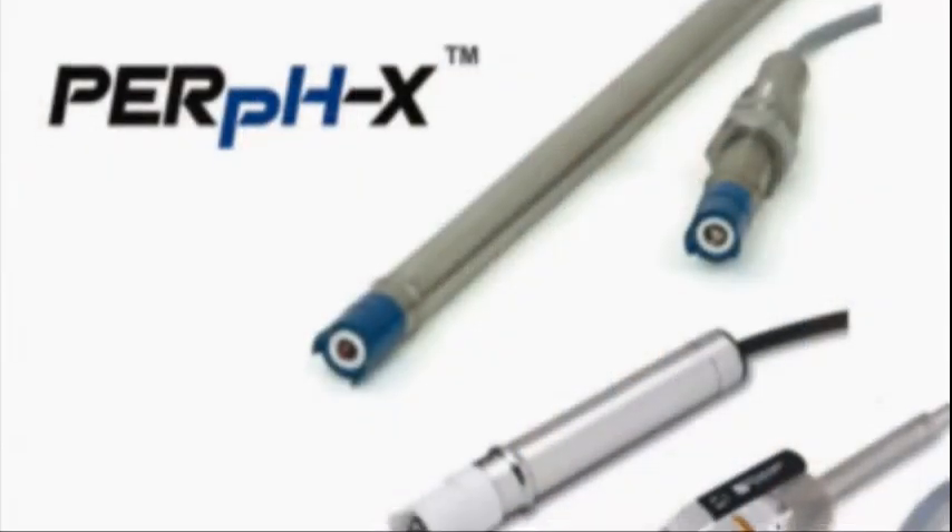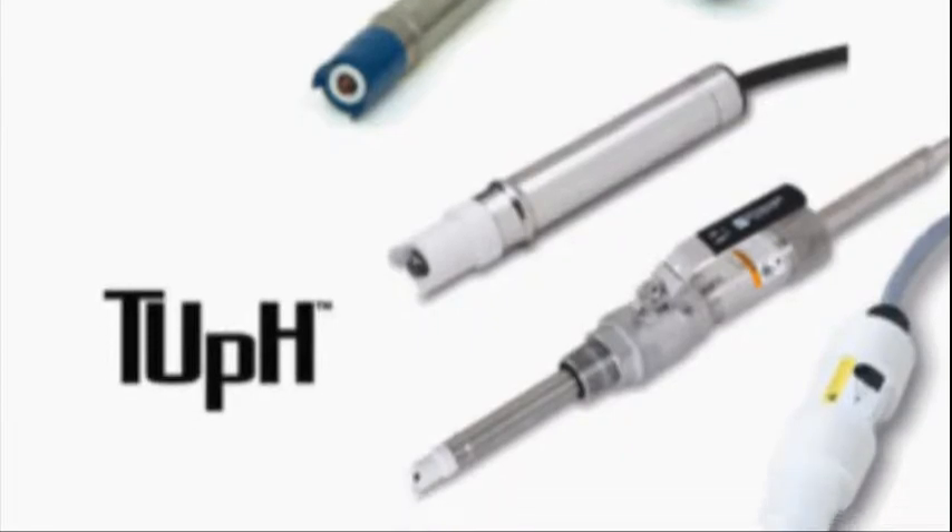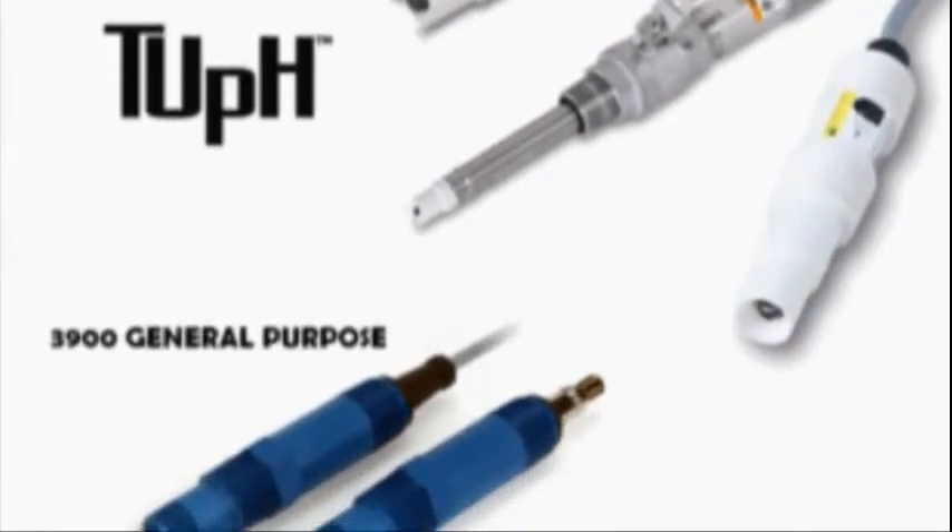Today we are going to show you how to do a two-point calibration on a pH sensor. All of Rosebonne Analytical's high-quality pH sensors can be calibrated the same way.